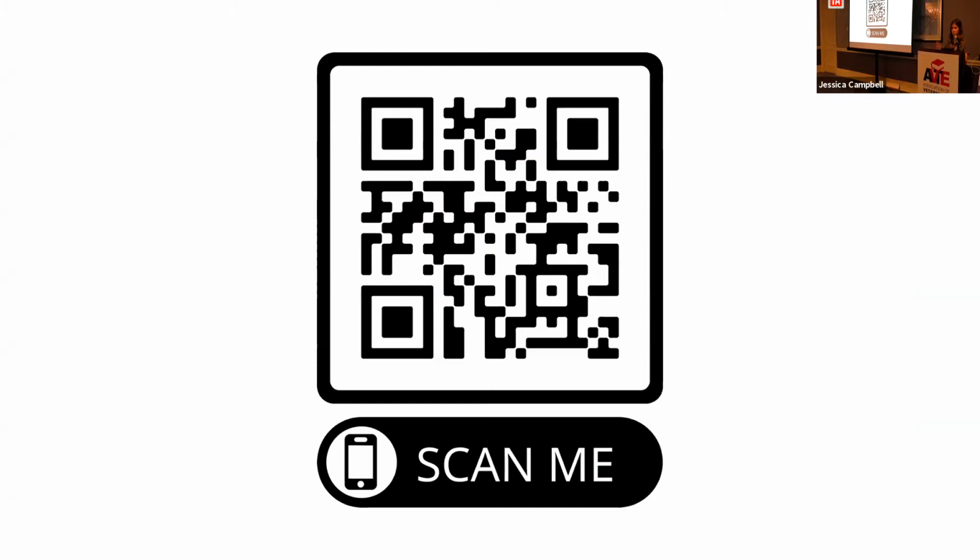And yes, even feedback on this portion. And if you are watching virtually, scan that app. Let us know if you have any questions. Perfect. Thank you. Once you're in the app, we'll just hang out, and then Dr. Cade's going to walk us through the specialties of Skoped Micro and the app specifically.